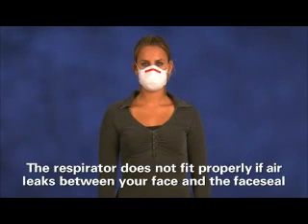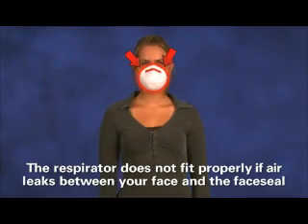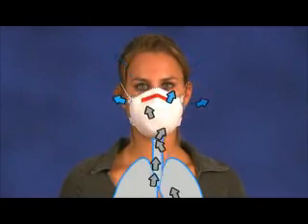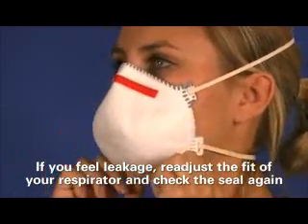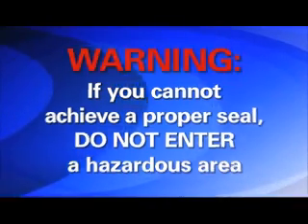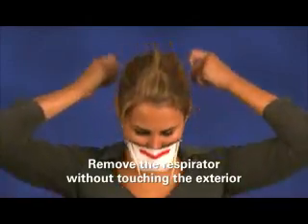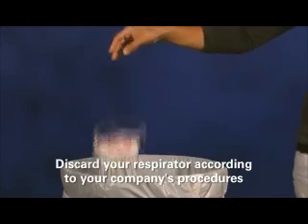During either test, if air leaks out between your face and the respirator's face seal, the respirator may not fit your face properly. One way that you can identify leakage is if you feel air blowing through the seal onto your face or eyes. If you feel leakage, readjust the fit of your respirator and check the seal again. If you cannot achieve a proper seal, you are not protected and should not enter a hazardous area. See your supervisor to determine what the problem may be. When you're finished wearing the respirator, carefully remove it without touching the exterior, because the exterior may be contaminated. Discard your respirator according to your company's procedures.